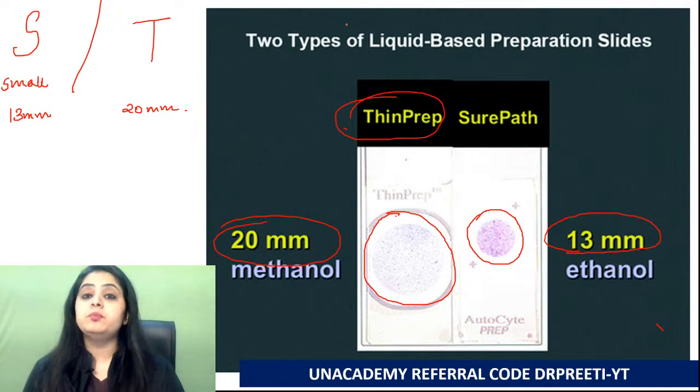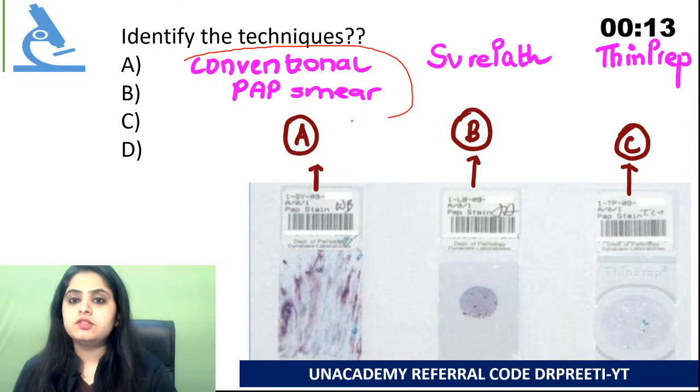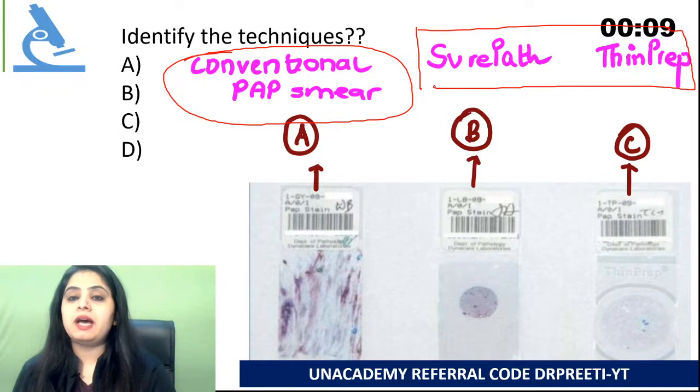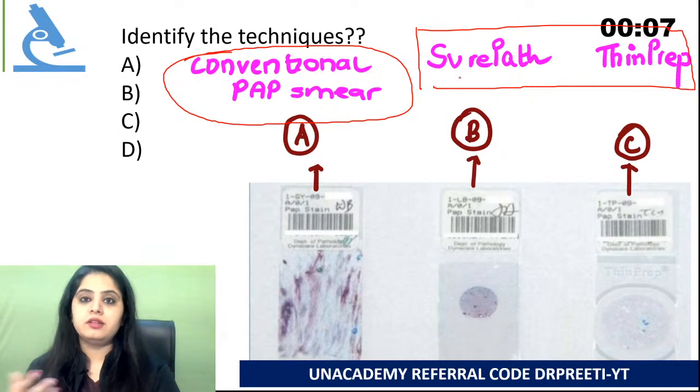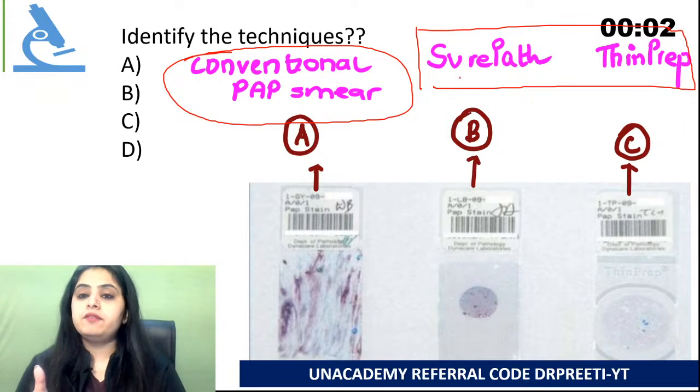So this is how you prepare all your pap smears, guys. Nowadays, many of the institutes just don't practice conventional pap smear. They also practice SurePath or ThinPrep. That depends on what machine they've got. One of the two they are going to practice. Are we okay with this?